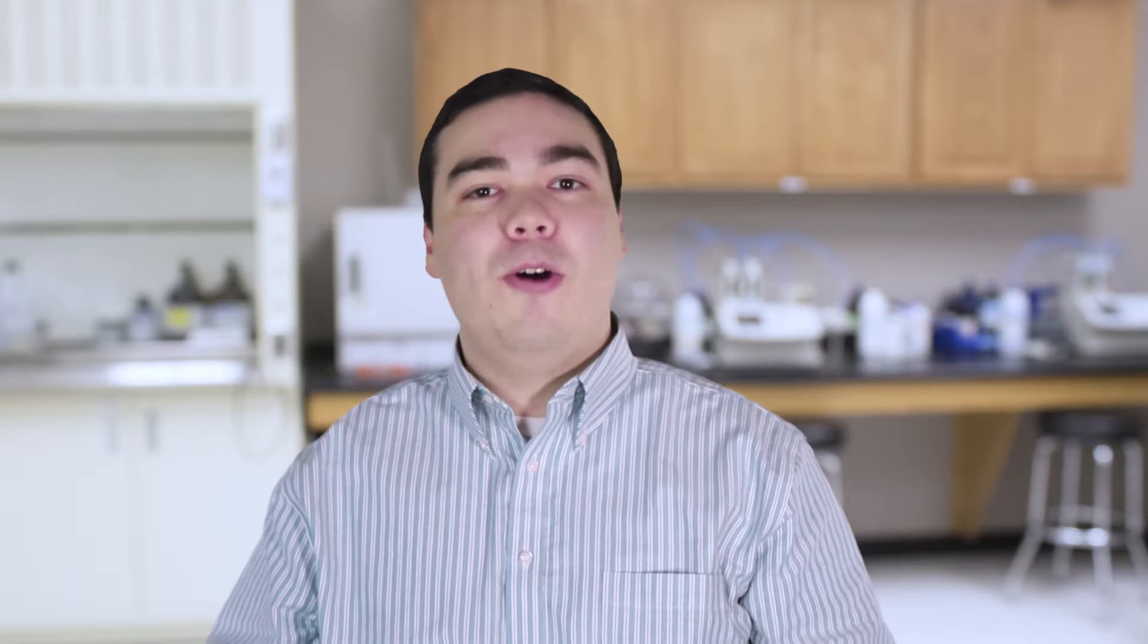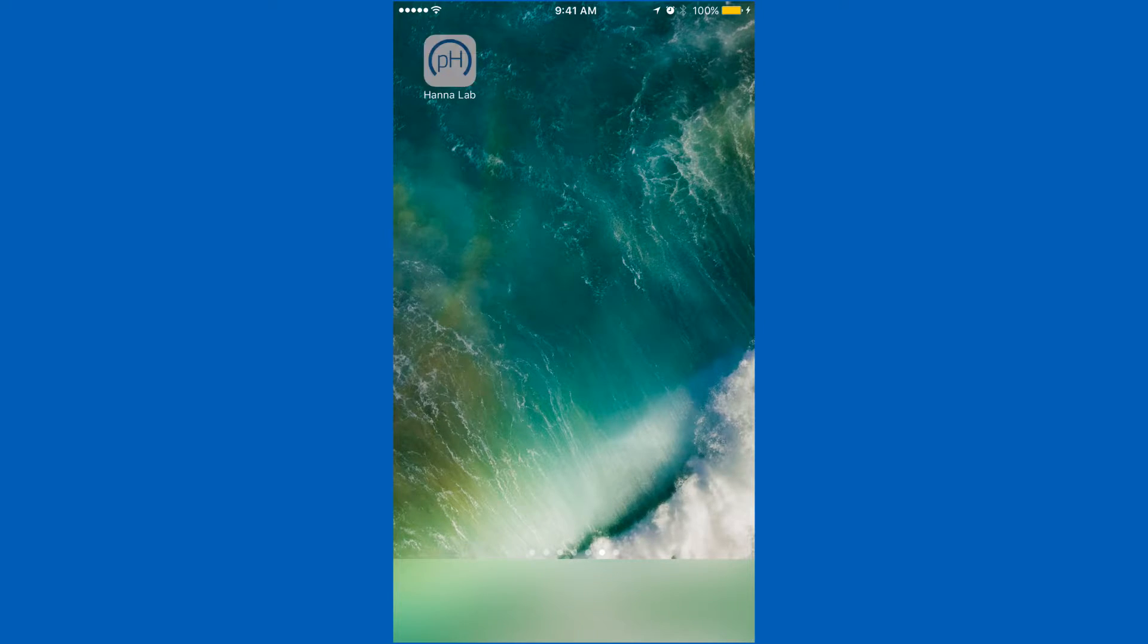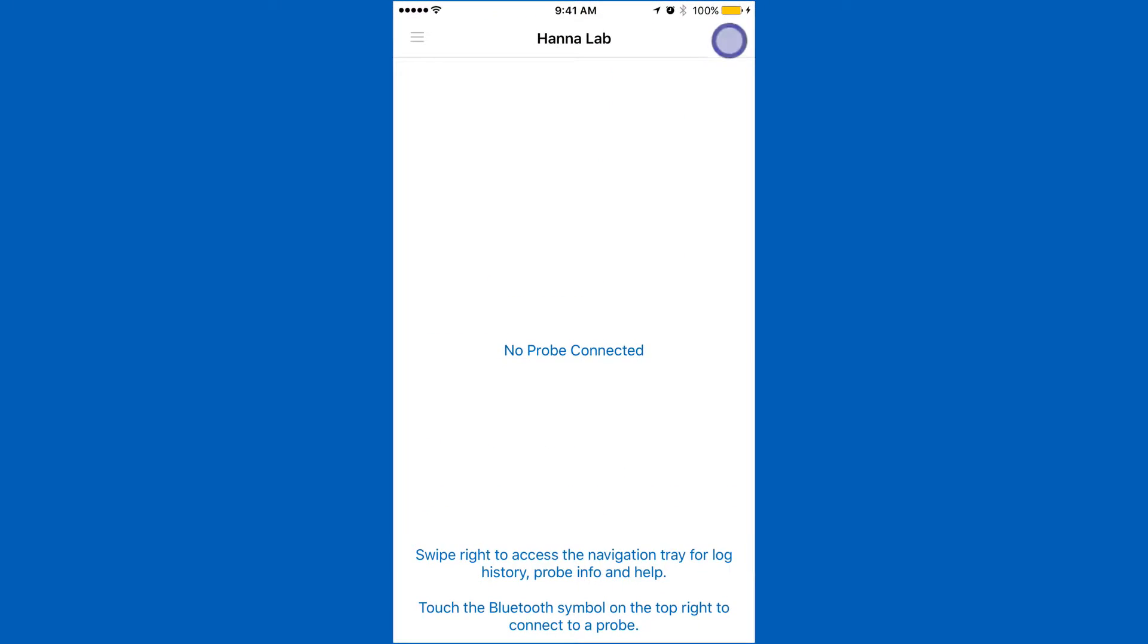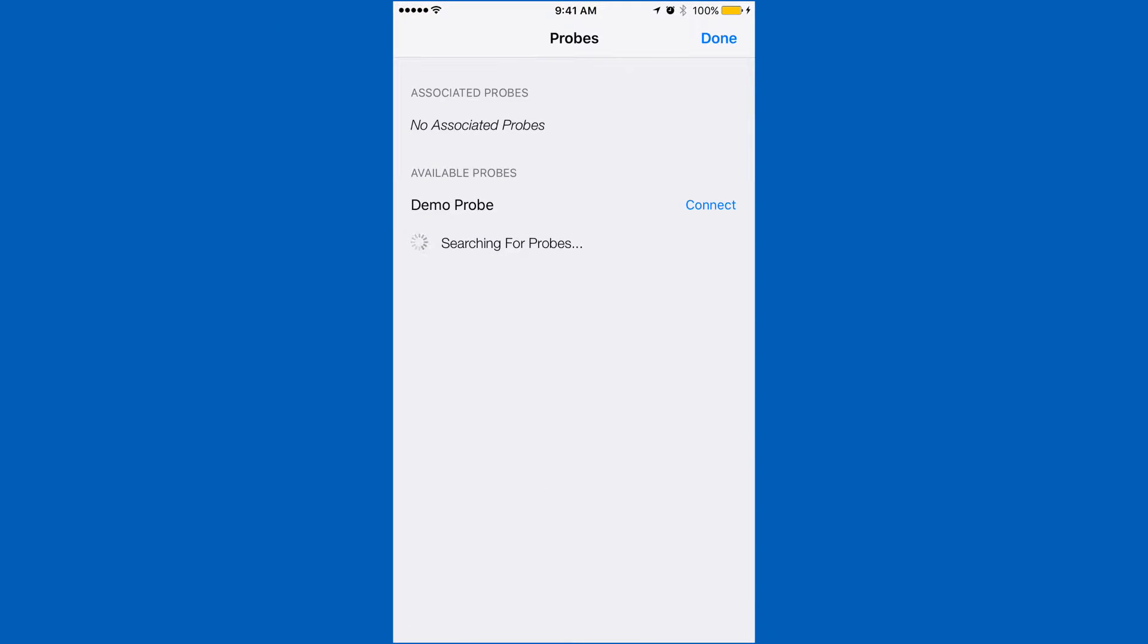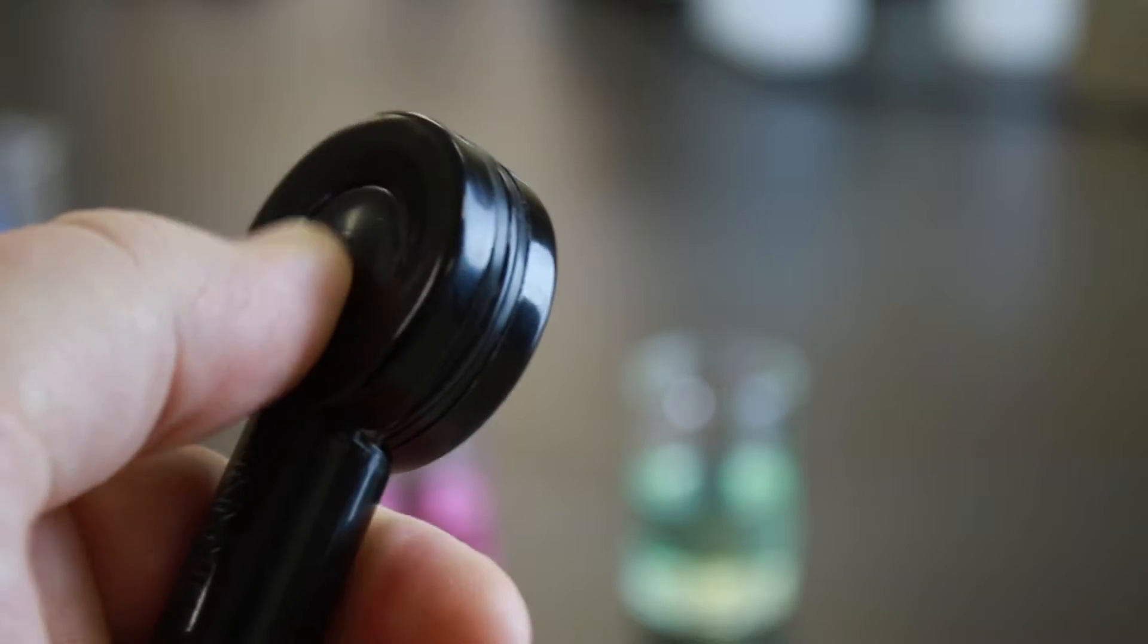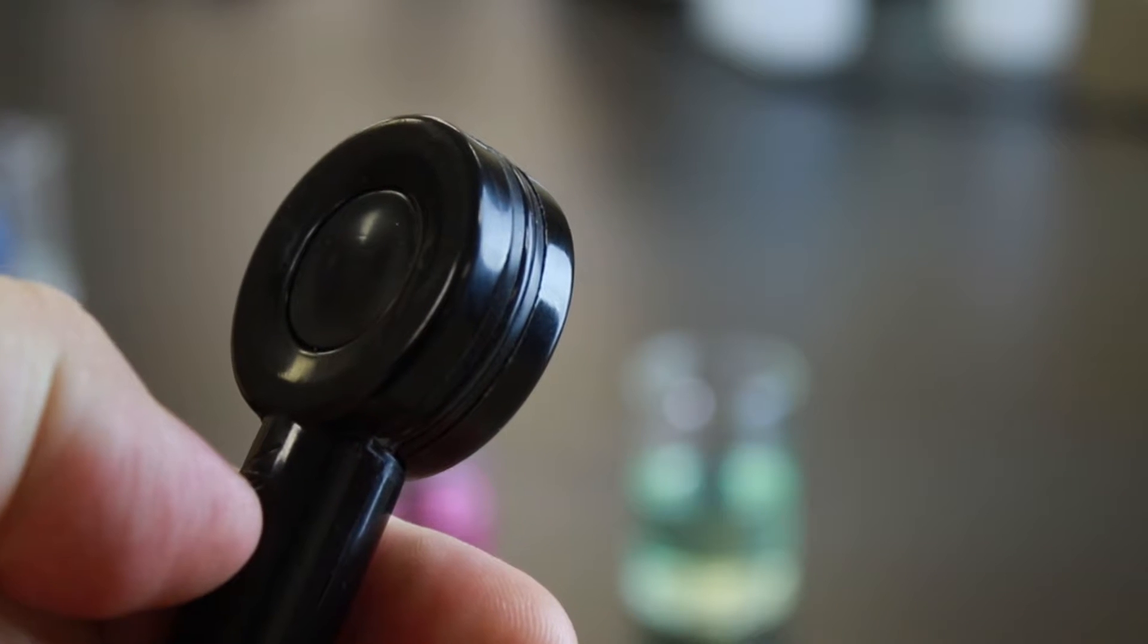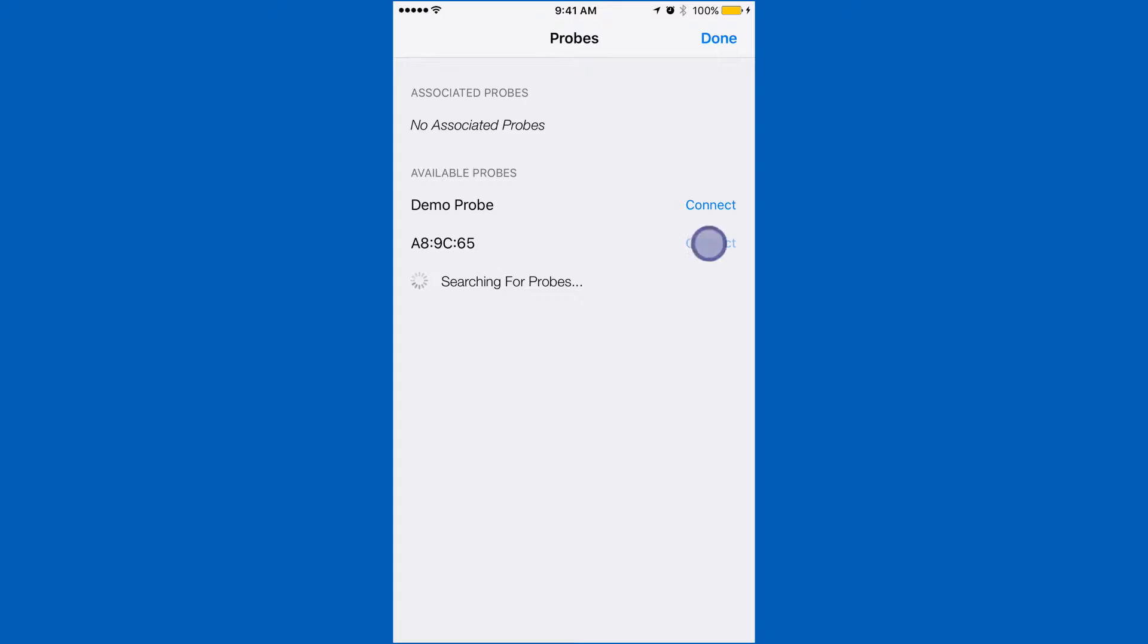To connect your Halo, be sure Bluetooth is enabled on your device. Open our HANA Lab app and press the Bluetooth symbol. Press the button on your Halo and our app will recognize the electrode. Tap connect and you'll be ready to calibrate.